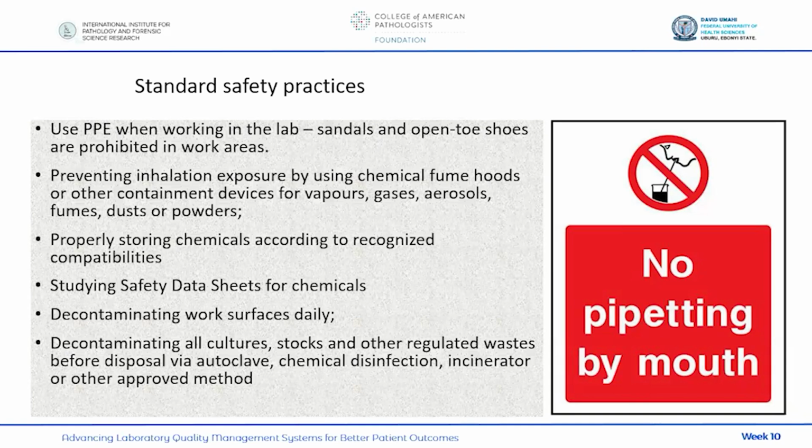Then you store your chemicals according to recognized compatibilities. And here, the safety data sheets are very important. They are critical when handling chemicals in the laboratory. So these safety data sheets should be studied by any personnel handling chemicals, whether you're storing it, whether you're a store officer or you're on the bench handling. For any chemical that you're going to handle, it is appropriate that you study the safety data sheet for that chemical.